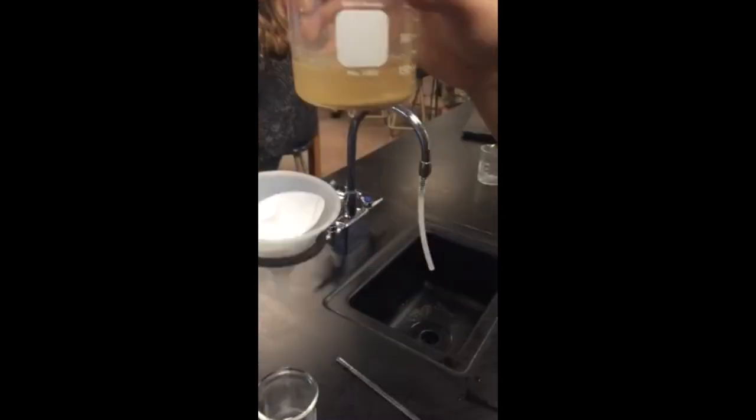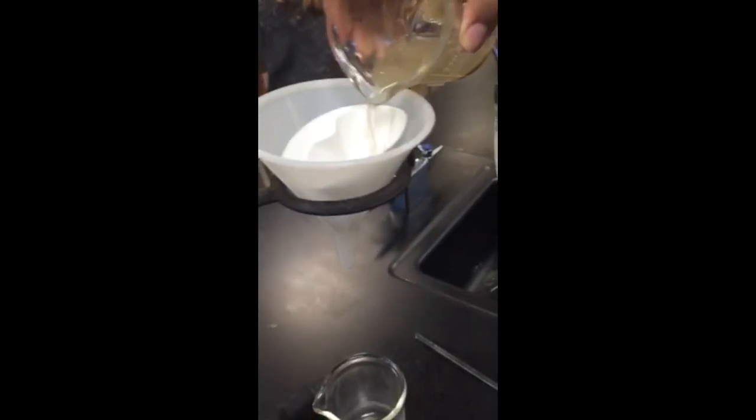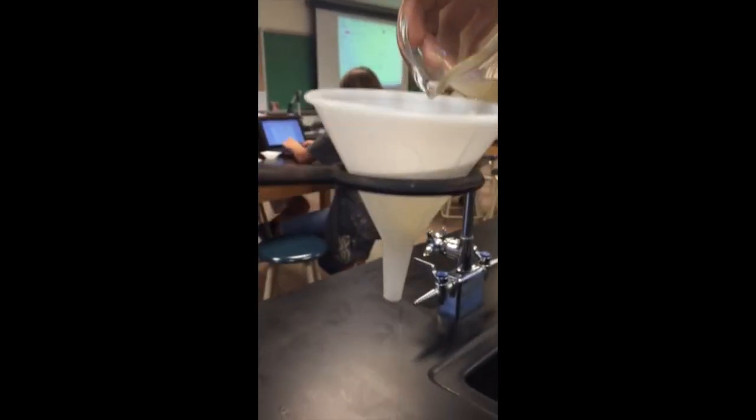This is my mixture of salt, sand, and water. And we're going to filter it through this paper. We're going to pour it slowly, making sure not to go over the top.